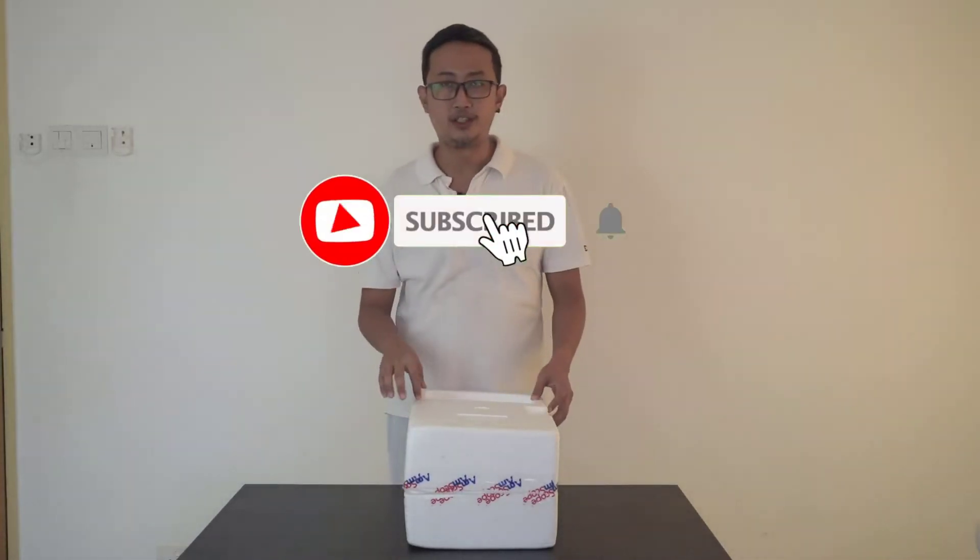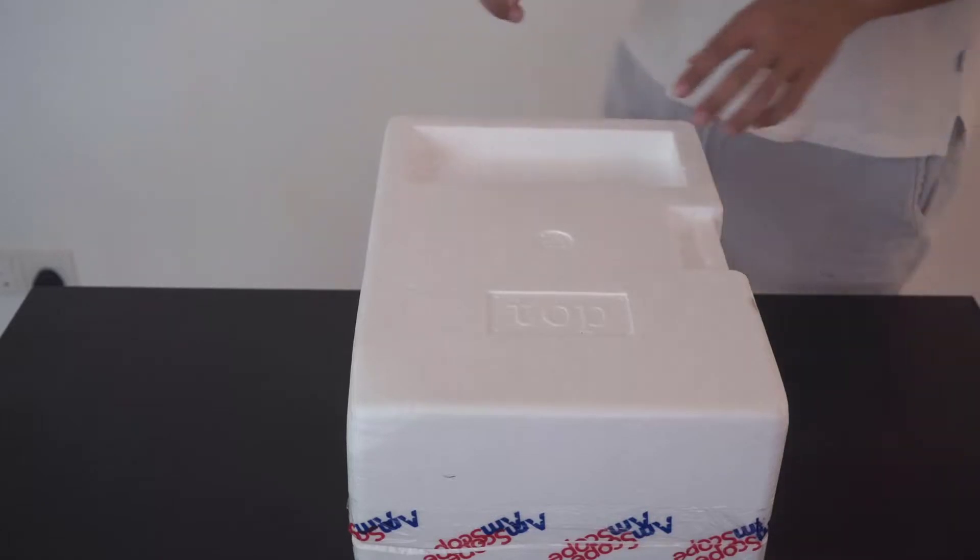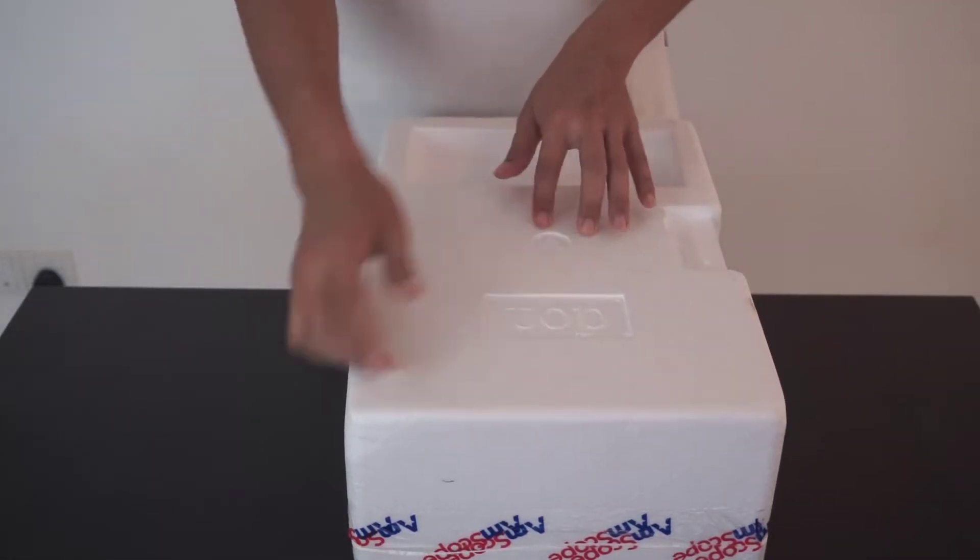Hi guys, today we will be unboxing the Amscope 120 series microscope. Before you take off the box, make sure the top is facing upwards.